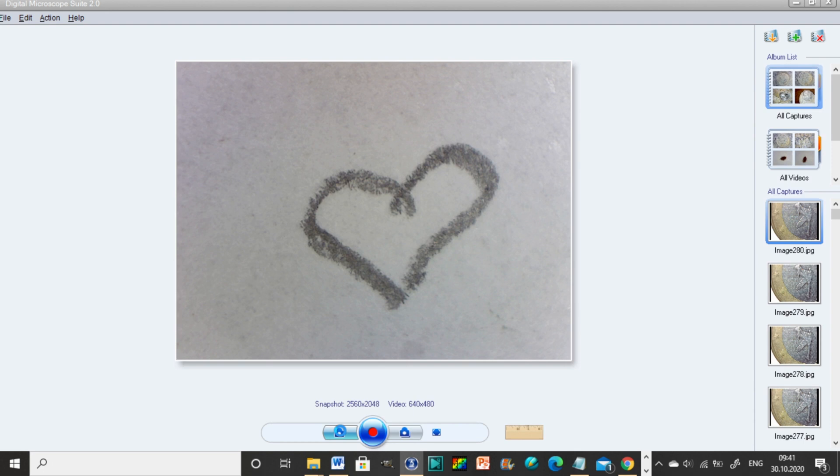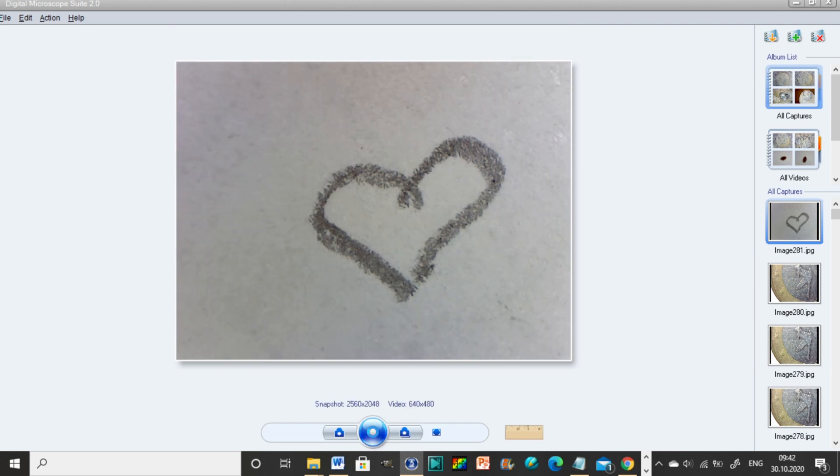And this is how you take a photo — just click on the photo icon. Here you can see all your captures. To take a video, just click the button in the middle and it's recording; click the same button to stop. You can also go full screen, and here's some footage I got while recording this video.